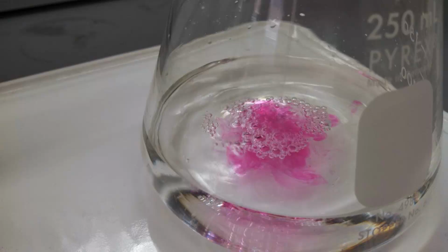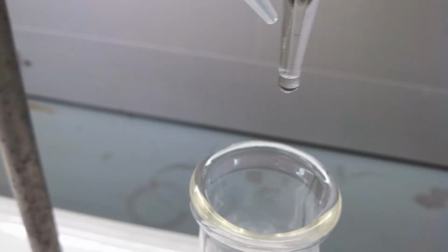At this point, you should start adding the titrant drop by drop, as slowly as you can mentally put up with. At some point, you may want to add a half a drop if you think you're really close to the endpoint. The way you do that is by letting the partial drop kind of get out of the tip of the burette but not fall, and then rinse it in to the titration flask with deionized water from your squeeze bottle.